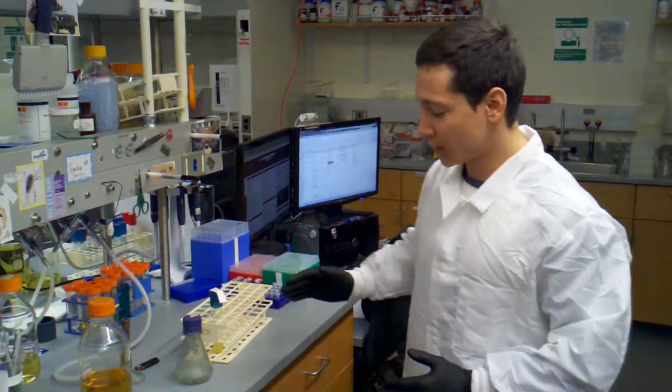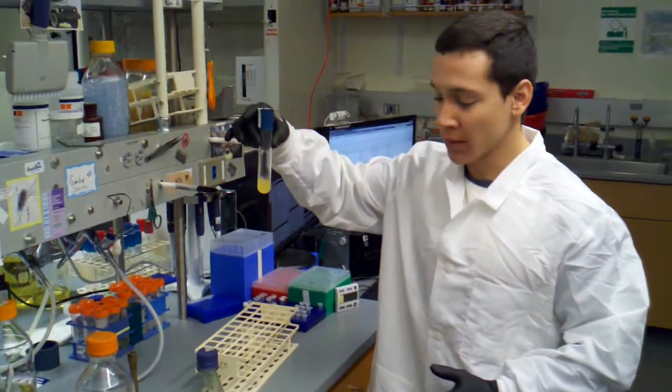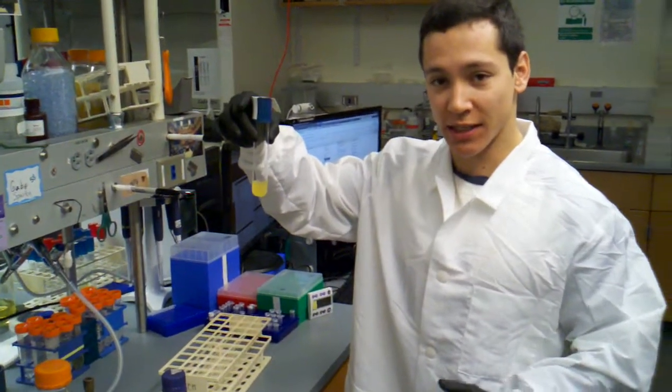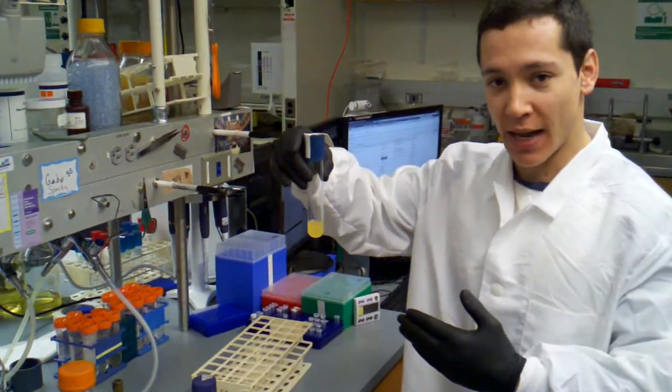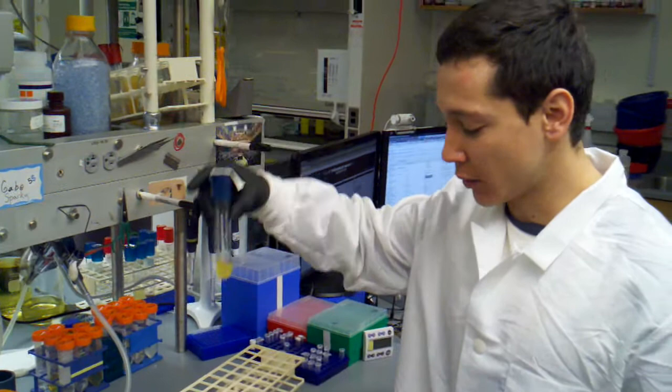The Datsenko-Wanner is used to integrate some sort of linear piece of DNA into the genome. So in order to do that, we'll be starting today with a little bit of culture. This culture has the cells that I want to go into, and it has a helper plasmid called PKD-46 in it, but I didn't start with this culture.